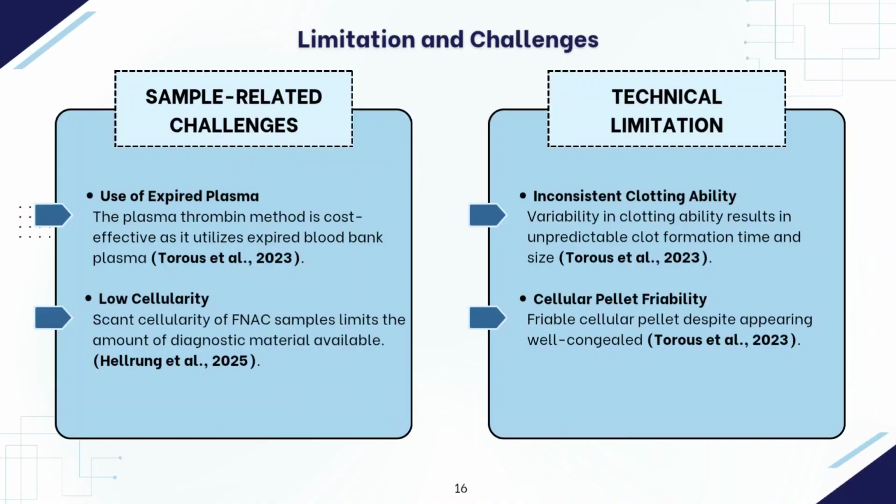low, the resulting cell block may be poorly formed and provide limited diagnostic material. This is especially challenging in small or deep-seated lesions, where obtaining adequate cellular yield is difficult. As a result, sample-related issues can already limit the diagnostic value at an early stage. Next, I will move on to technical limitations.